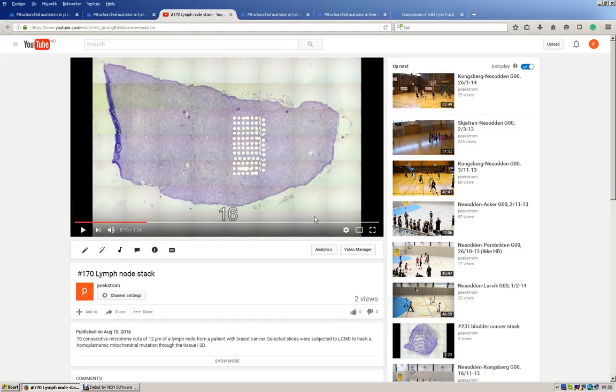The microscope is scanning and taking all these pictures and stitching them together. Unfortunately, that affects it, and we get some effect here that you can see that it is not a perfect circle, but if you look at it in a microscope, these circles will be round. So this is an artifact created by the software of the microscope, stitching together the pictures. As you can see, we have 1, 2, 3, 4, 5, 6, 7, 8 times 1, 2, 3, 4, 5, 6, 7 pictures that are stitched together in the microscope.